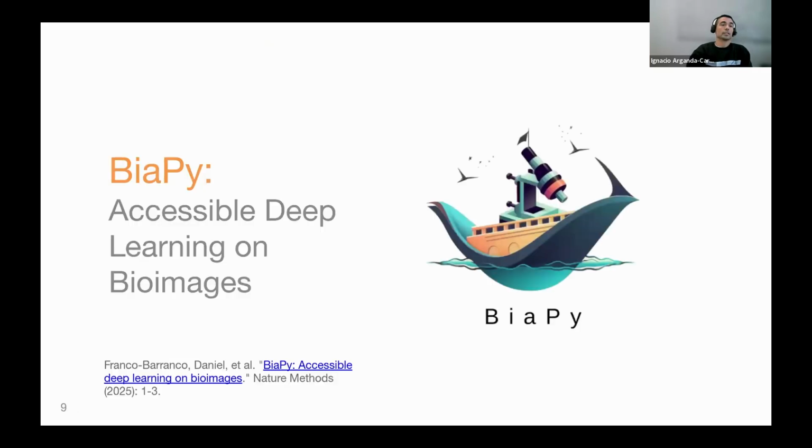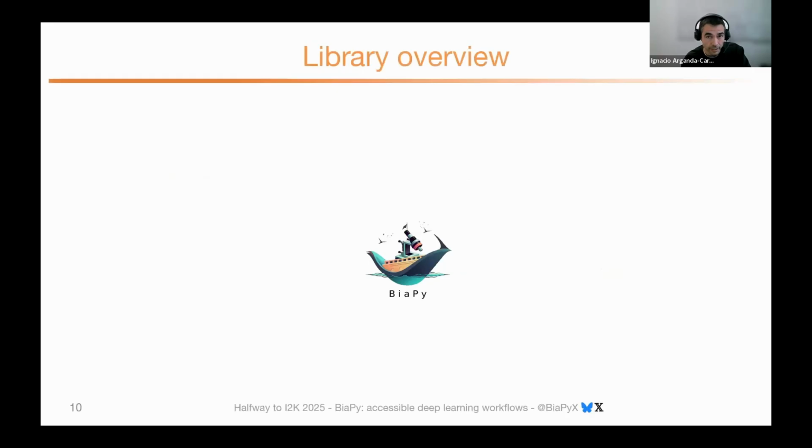So here is how we started BiaPy. It was finally published this year in Nature Methods as BiaPy: accessible deep learning on bioimages. Let me show you an overview of BiaPy.